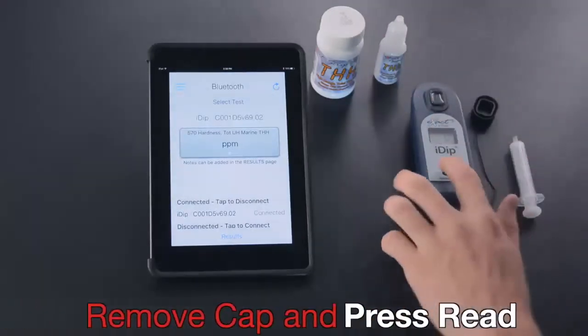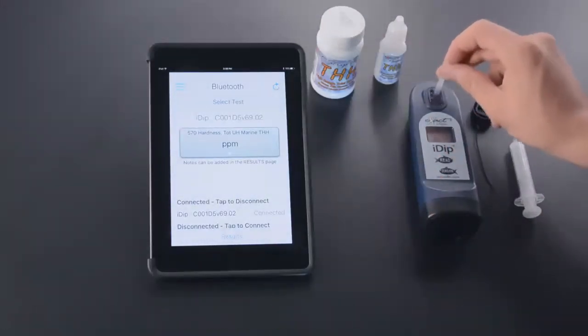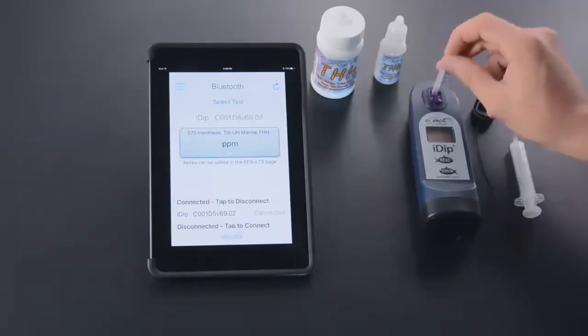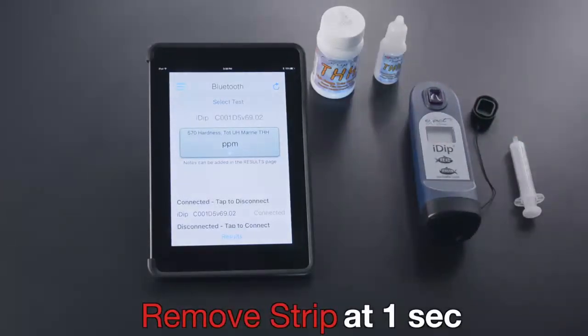Remove cap and press read. Get strip 20 seconds, one to two strokes per second. Remove strip at one second.